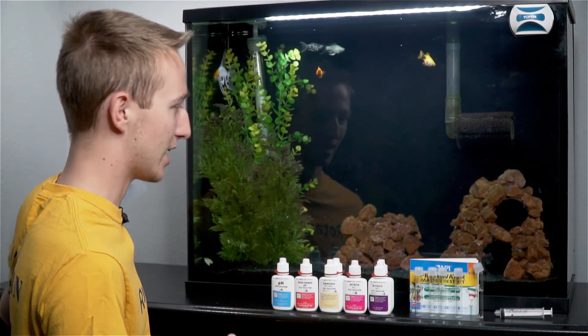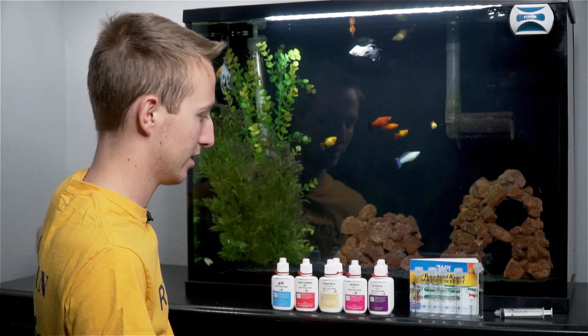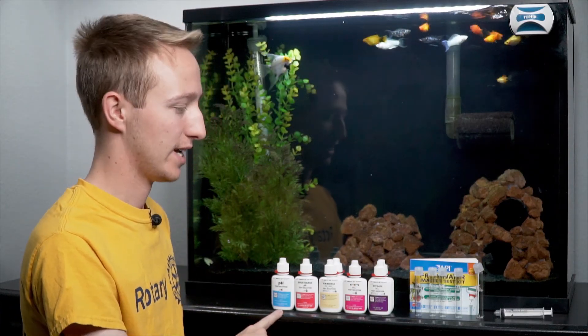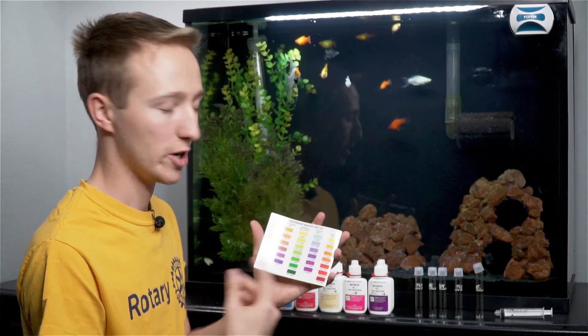In that test kit, it's going to come in a little plastic container just like this. You'll get four test tubes — I have five because I have multiple test kits since I drop my test tubes a lot and you can buy extras. It also comes with all the testing instructions and a guide on what you're measuring.